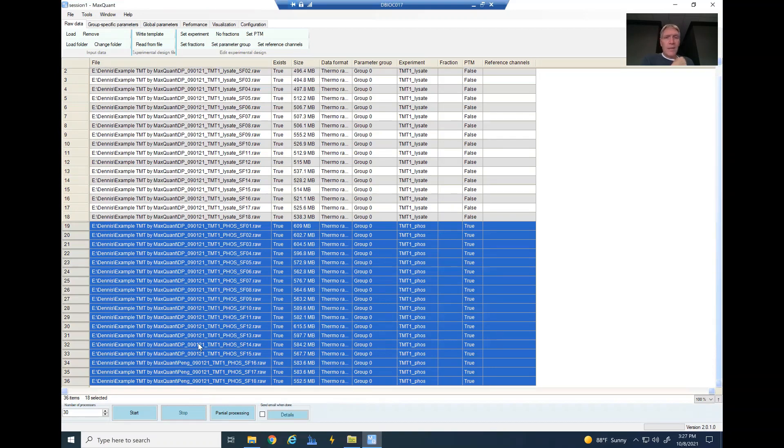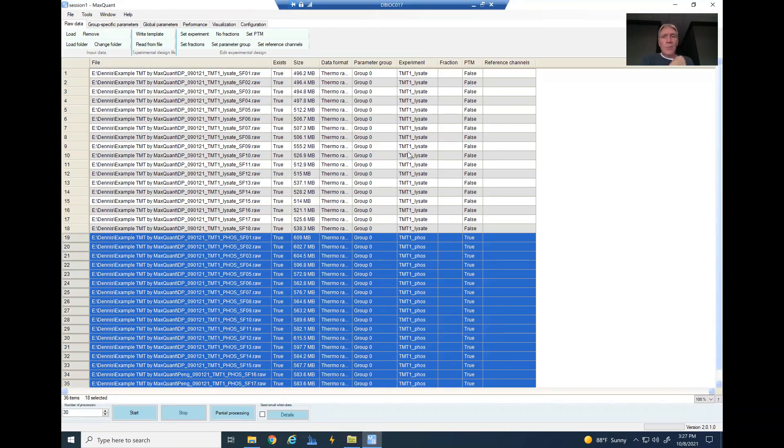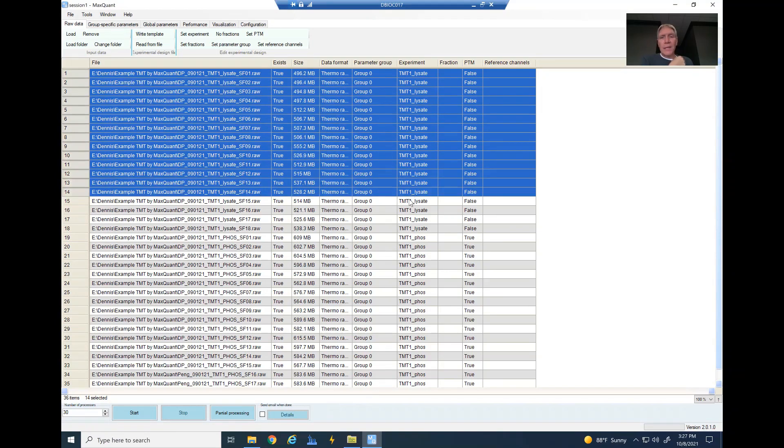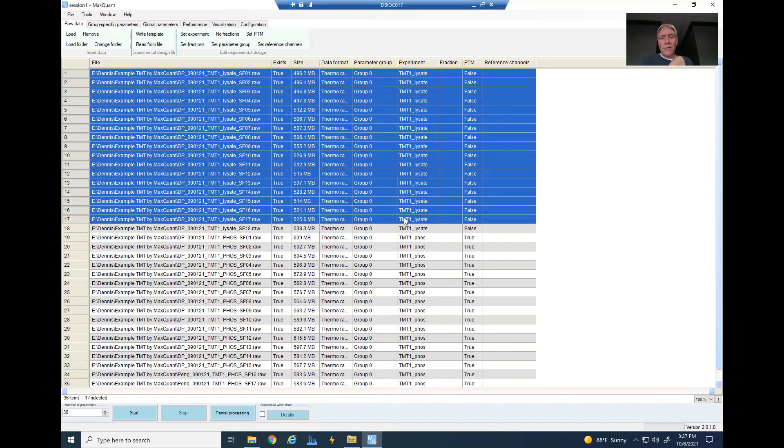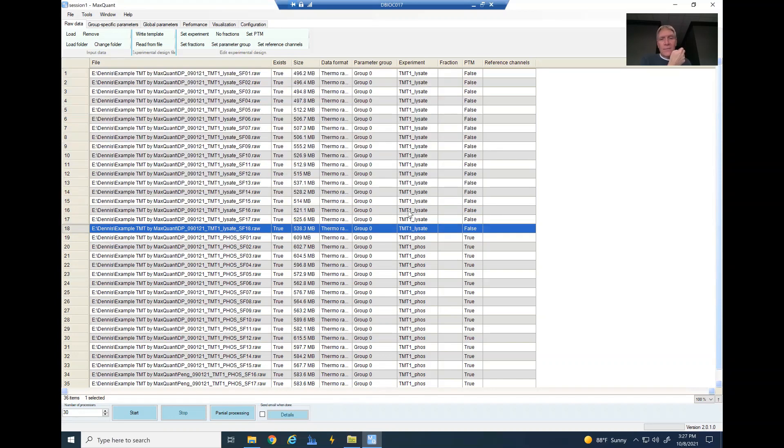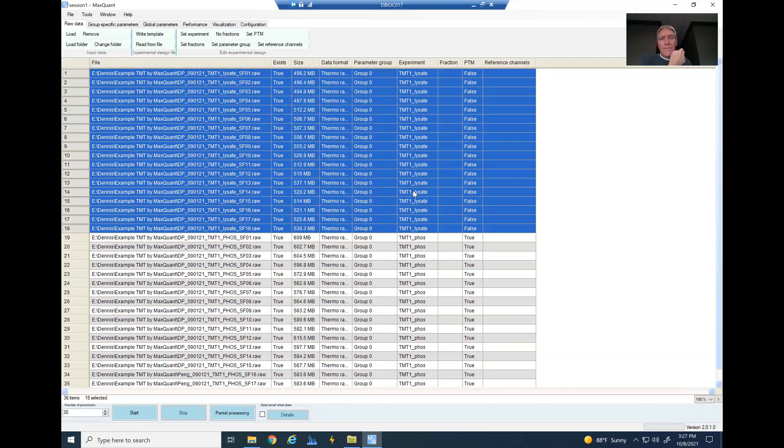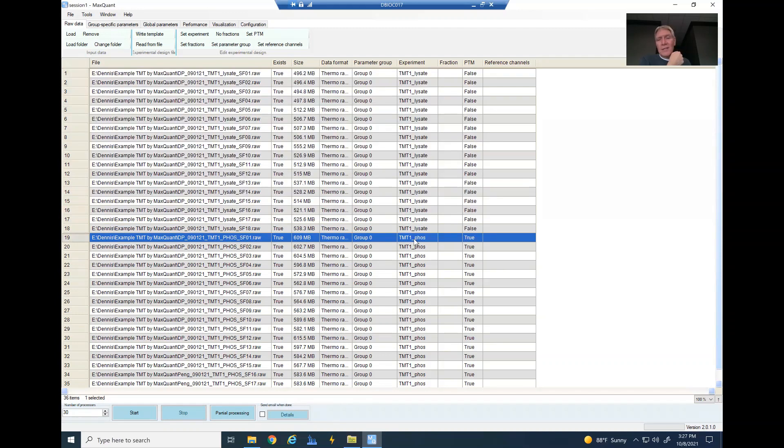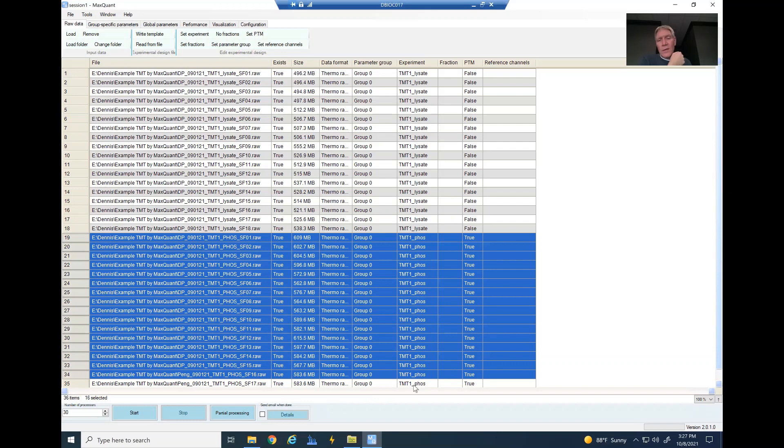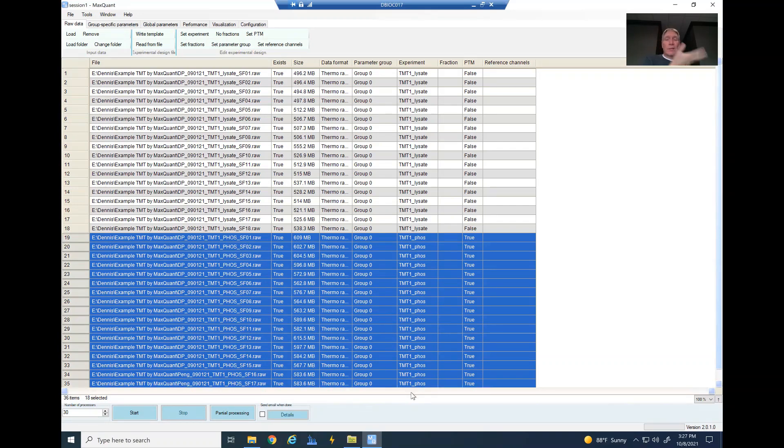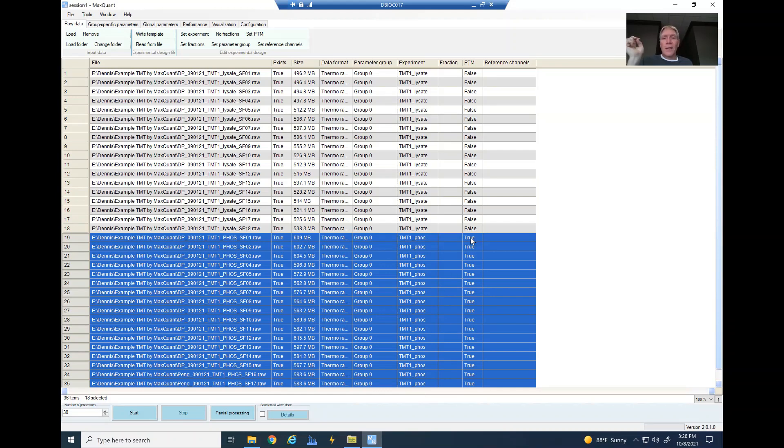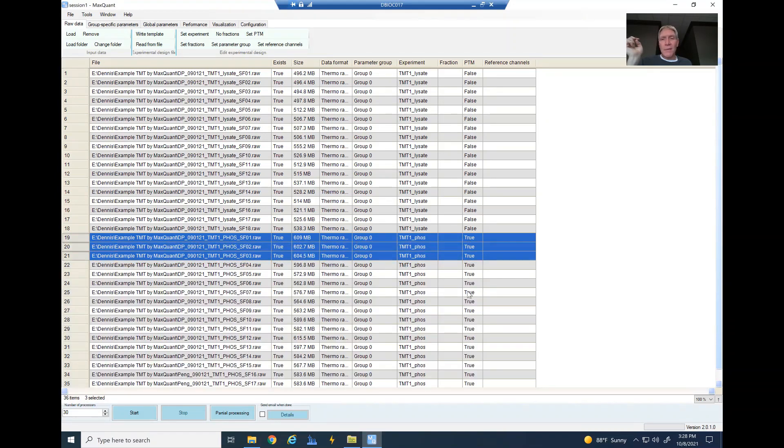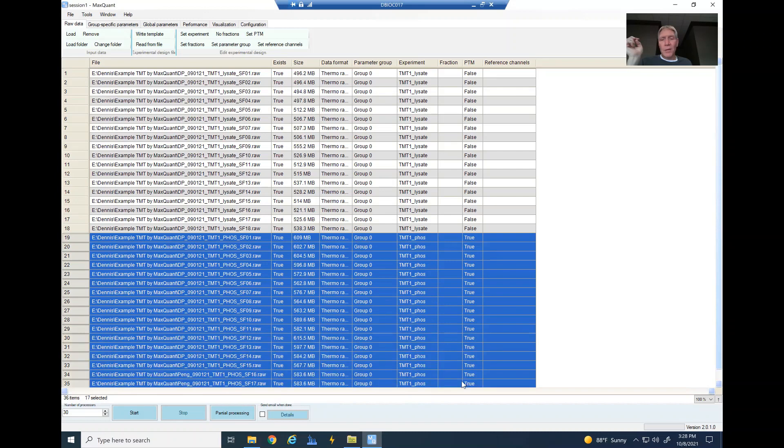Now I went ahead and changed my experiment label so that the TMT1 lysate is for the first 18 fractions, all included there, and then TMT1 phospho for my second experiment. That's why when you get your output, it will have those set up into different groups. And then of course, because phospho is a PTM experiment, I've got that changed to true.